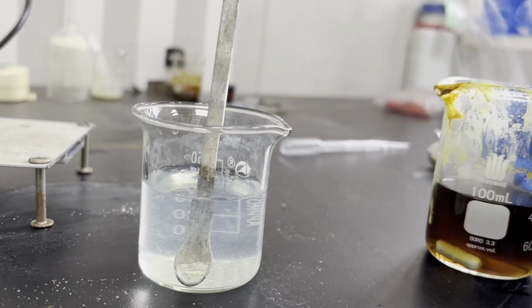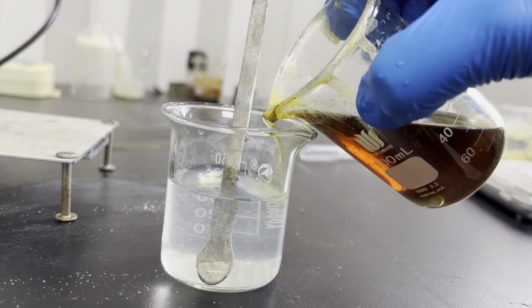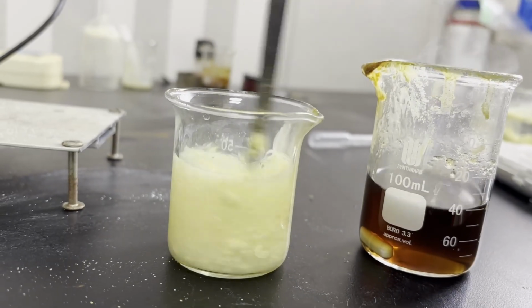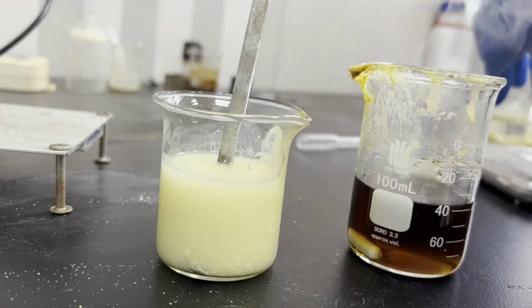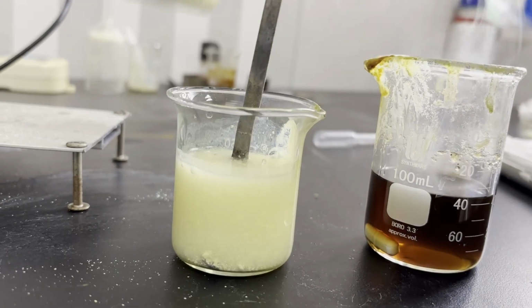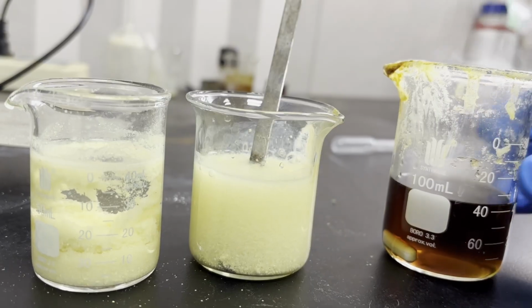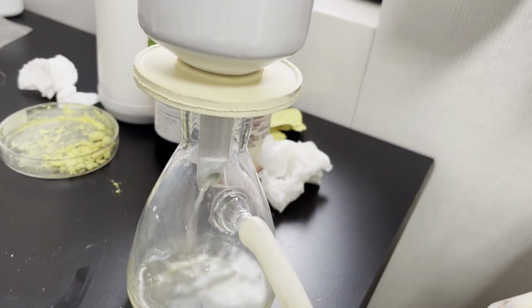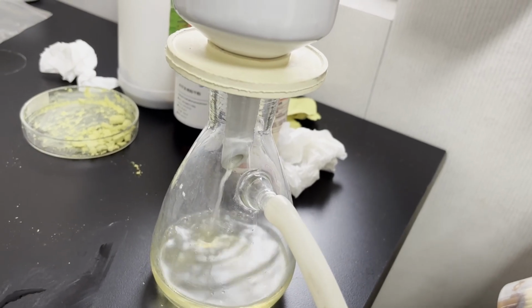Just like before, I take the reaction mixture off heat and pour it into water, and a light yellow precipitate immediately appears, which has a different color from our acridone starting material in the Petri dish, showing that the methylation reaction probably worked. In total, I used about 200 ml of water to dilute the reaction mixture and remove most of the DMF and potassium tosylate, and now everything is suction filtered. N-methylacridone is also insoluble in water, so a few water washings are done to remove remaining DMF and salts.